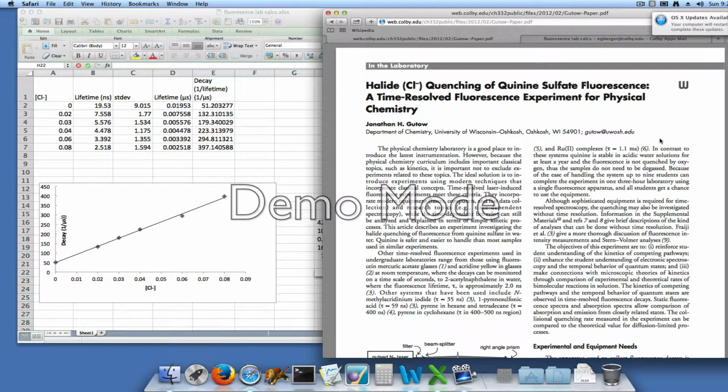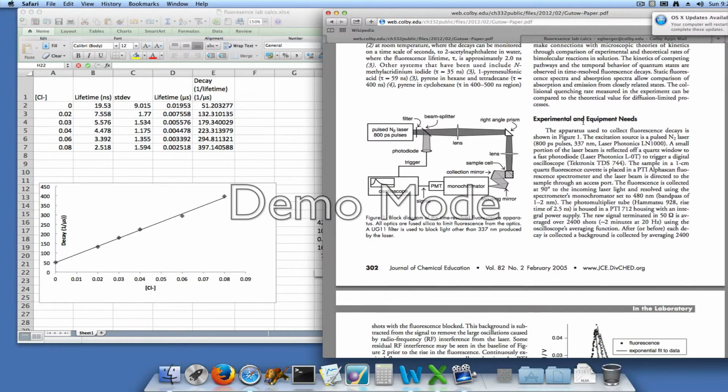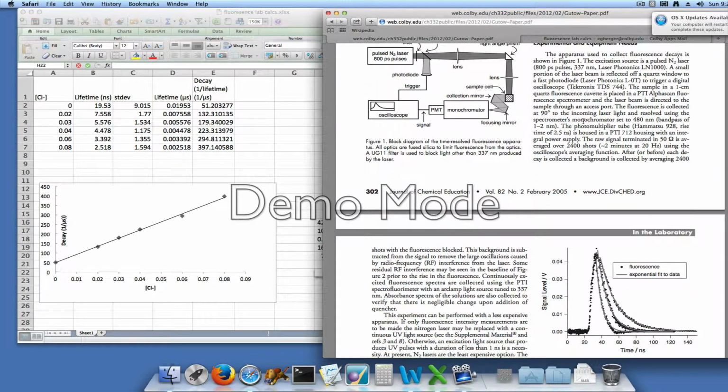And so what we wanted to do was measure how long those electrons stay at the excited state before they come back down, which is basically we wanted to measure the difference in the time if you took a stopwatch and pressed start when you emitted the exciting photon, when you pulsed the laser source, and measure how long it took for the emitted photons to come back out.